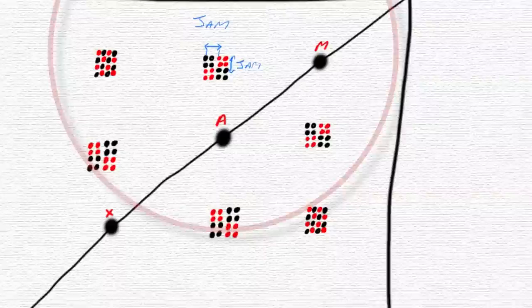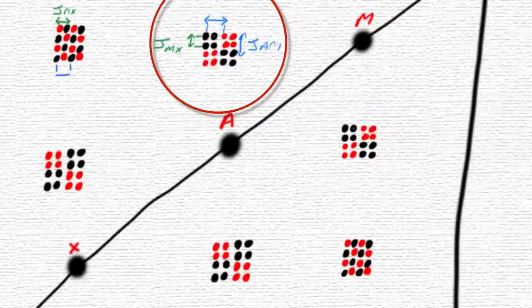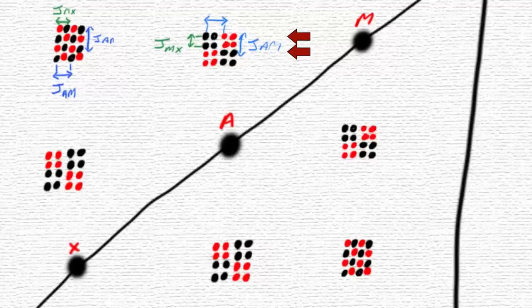So if we look at the cross peak in a bit more detail, we can see that the active spin coupling, because remember, for this particular cross peak, M is coupling to A, but it also couples to X. But this is not the cross peak for that, this is the cross peak for A. So the active spin here is the A spin, and that shows up as an anti-phase relationship, so it's black and red.